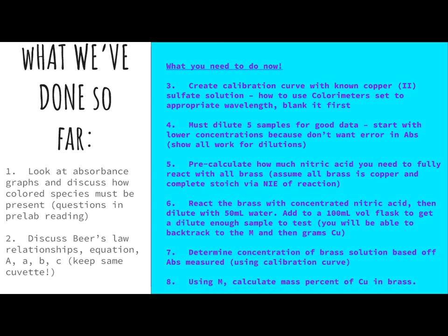What do we have for? We have 4. This one is 20. We have 30.